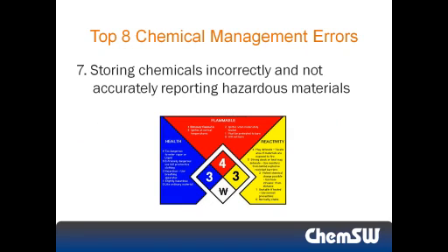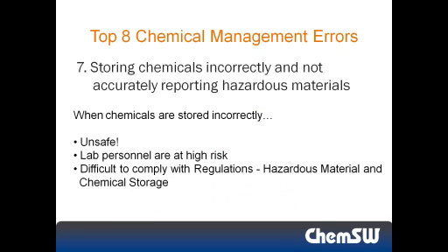Another common chemical management error is storing chemicals incorrectly and not accurately reporting on hazardous materials. When chemicals are stored incorrectly, well, it's unsafe for all lab personnel. Organizations that don't label chemical containers with specific instructions for storing the container run significant risk of that container being put back in the wrong place.